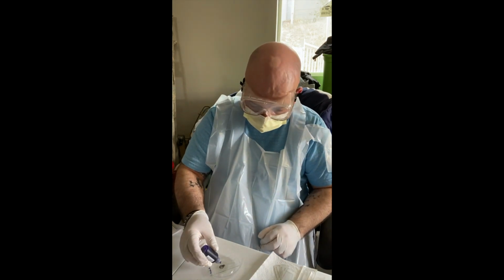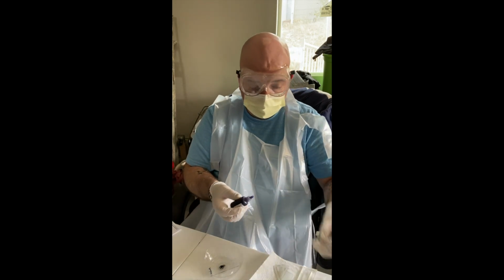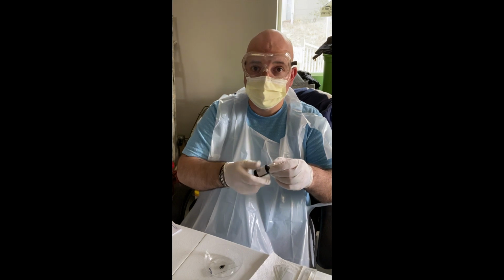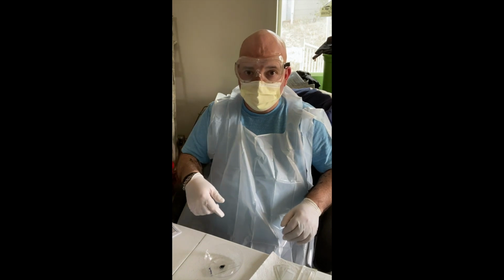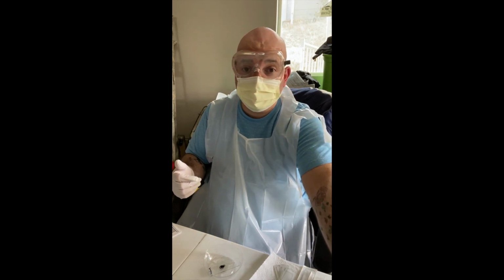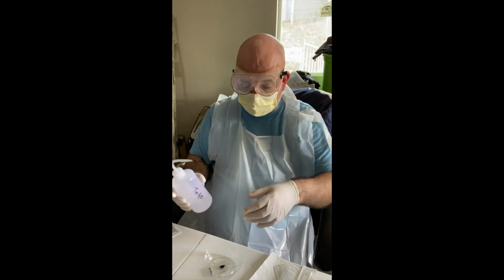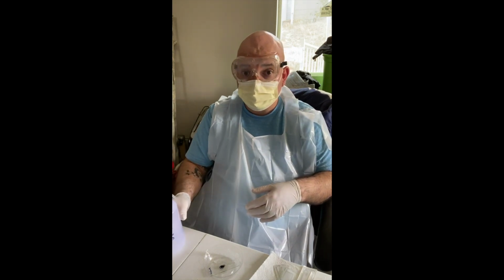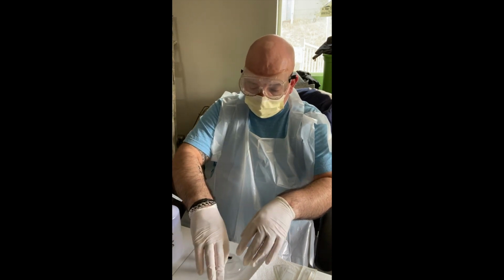Okay, so one and 2 drops. Okay. So that's going to sit for 1 minute. Alright, so the Crystal Violet has sat for a minute. Now what I'm going to do is I'm going to rinse the stain off the slide using good old tap water. So I'm going to place the slide at an angle and then just rinse the slide until the color, if you will, from the slide is gone and my water runs clear.